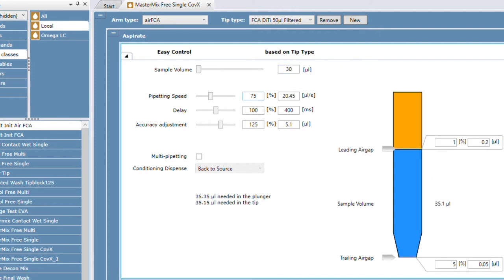Pipetting speed is kind of self-explanatory — it's how fast you're going to be pipetting. The reason why you'd want to pipette slower or faster is to make sure you're getting all the liquid out. If you're having too much retention, you want to maybe increase the speed. But if you have too much blowout — meaning liquid is flying around — then you want to decrease the pipetting speed.